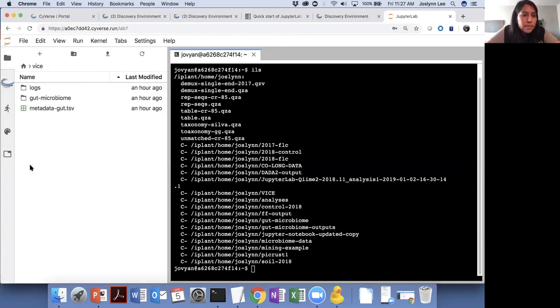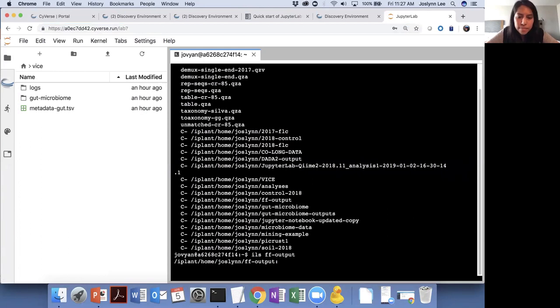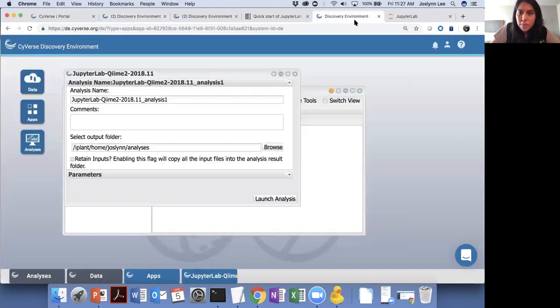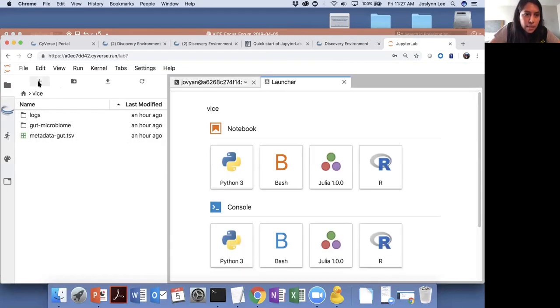And it looks like the Jupyter notebooks were not transferred over. So I'm going to upload from my, well, let's see. I'm going to investigate here. Yeah, ils output. They might be saved on this part of, okay, so there's two of them. Bear with me for a minute. I think because I closed out, it might not have transferred those notebooks. So give me a second to figure out where I saved them.